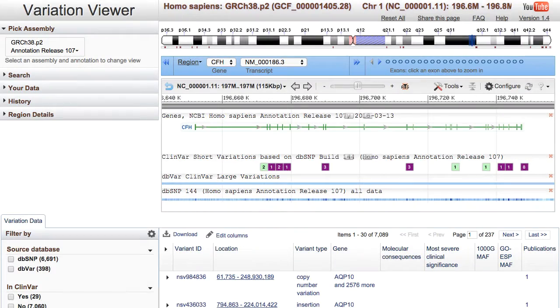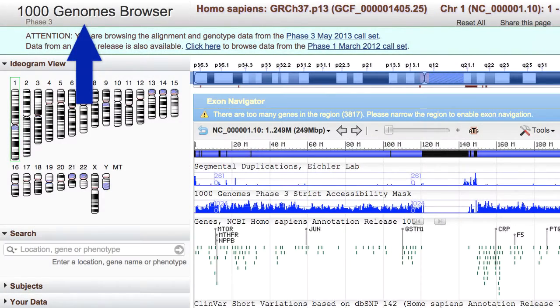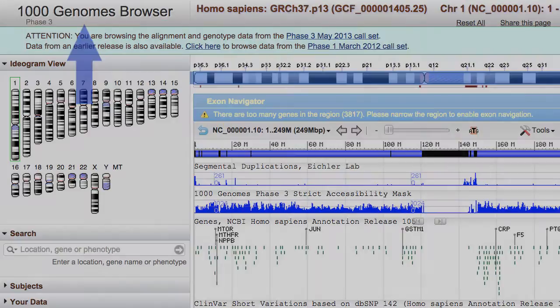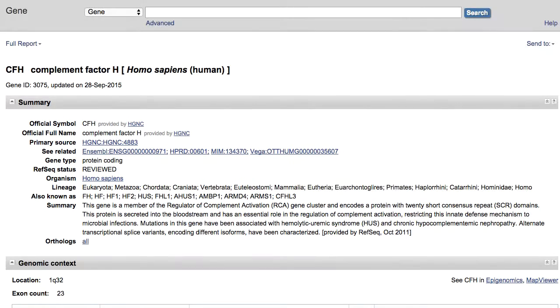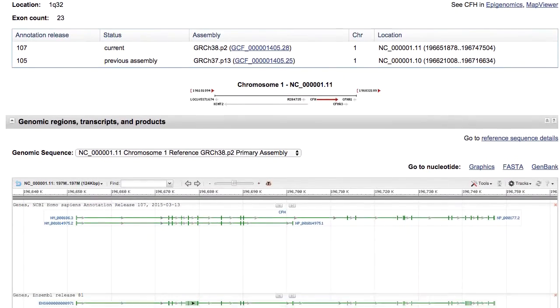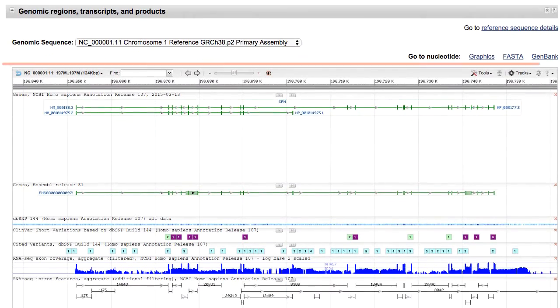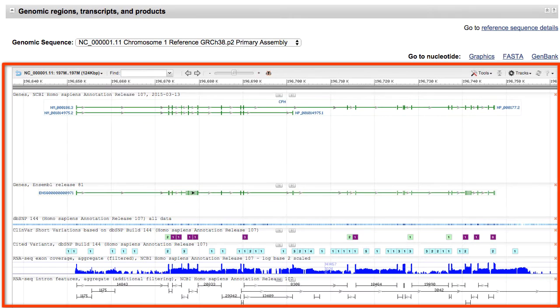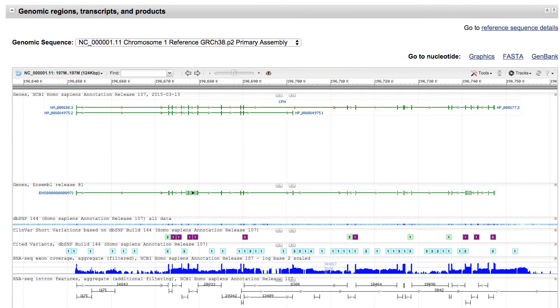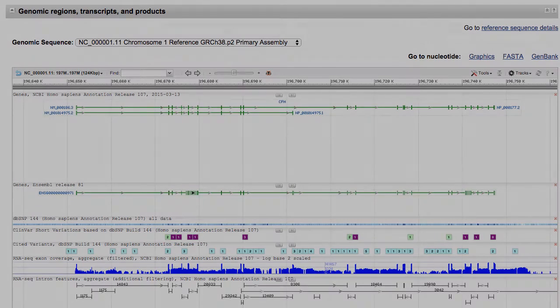If you are not familiar with our browsers, which include the Variation Viewer, the Thousand Genomes browser, and the NCBI Sequence Viewer graphical displays such as those embedded on Gene, dbSNP, CloneDB, and other record pages, we provide active links near the end of this video to those browser tutorials.